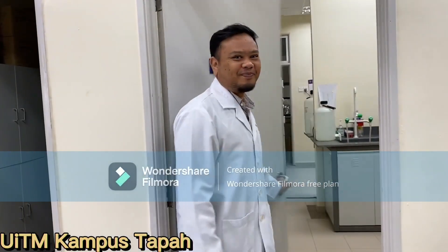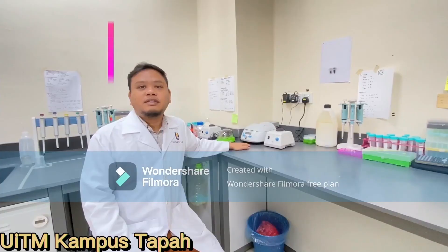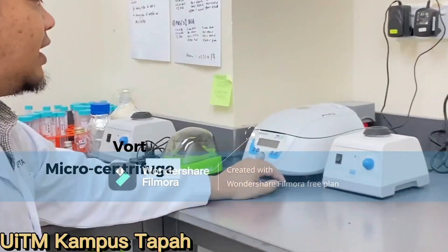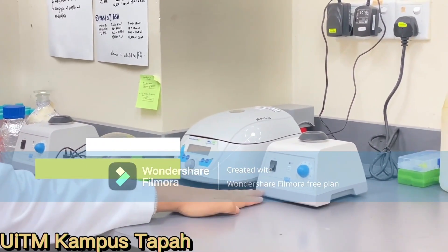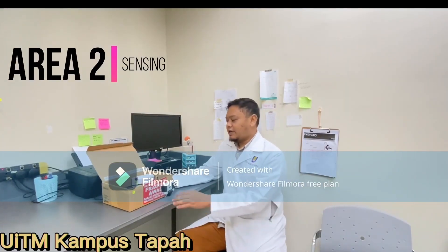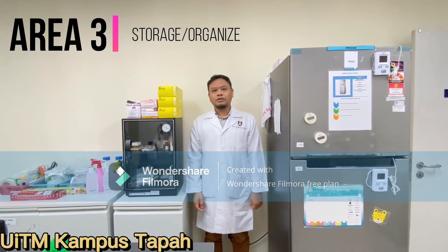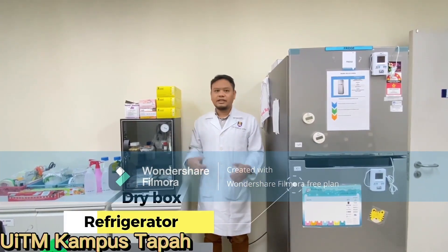Hi, welcome to our lab. This is our workstation to prepare samples. Here is our microcentrifuge and our vortex. This is our sensing area, and here we have the potentiostat to analyze our samples. This is where we store most of our samples — in the dry box and in the fridge.